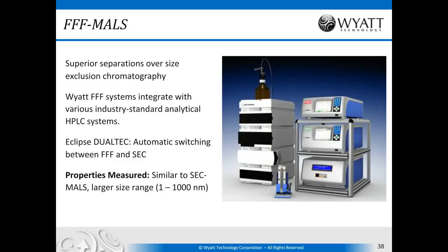Next tool I'll describe is FFF-MALS. So FFF, field flow fractionation, is a separation system, similar in concept to SEC, but it does work differently, and it is superior in many ways to SEC. It's a little more complicated.